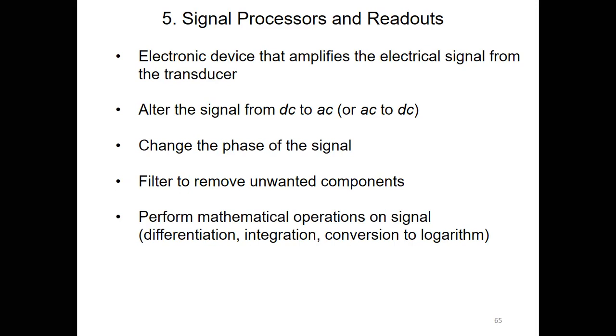We can get the first derivative, second derivative, like that. So when we get the first derivative spectrum or second derivative spectrum, the signal processor will automatically process the signal. It will perform a mathematical function like differentiation to convert the normal spectrum into a derivative spectrum, right? So those are some functions happening in the signal processors.